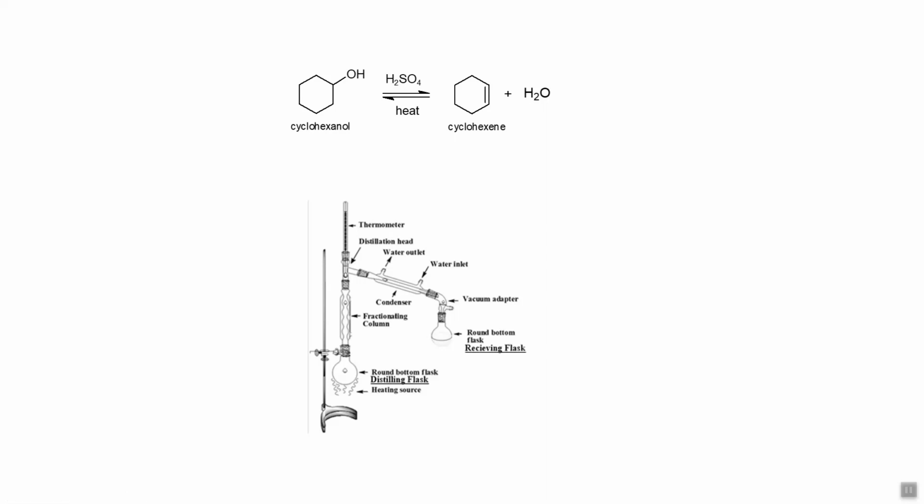Now, I'm kind of weaving the experimental stuff in with the theoretical stuff. So you're going to have to pick that out when you're writing your hypothesis, to make sure you're focusing more on the theoretical stuff than the experimental procedure stuff.